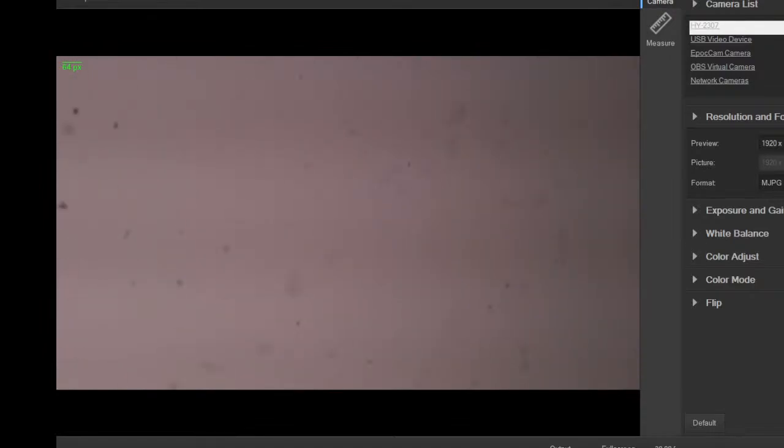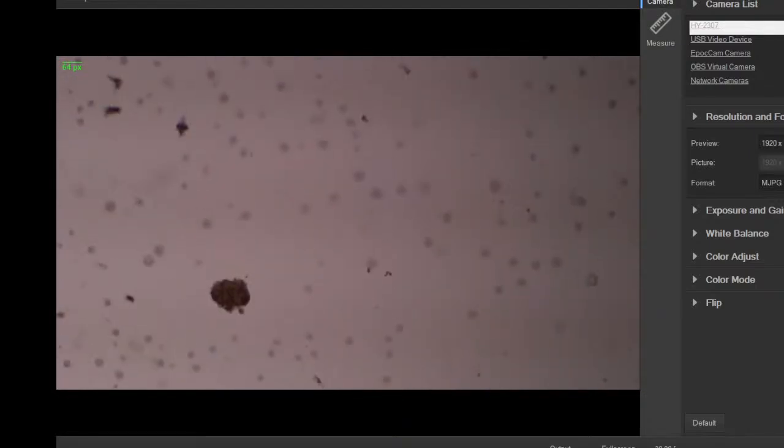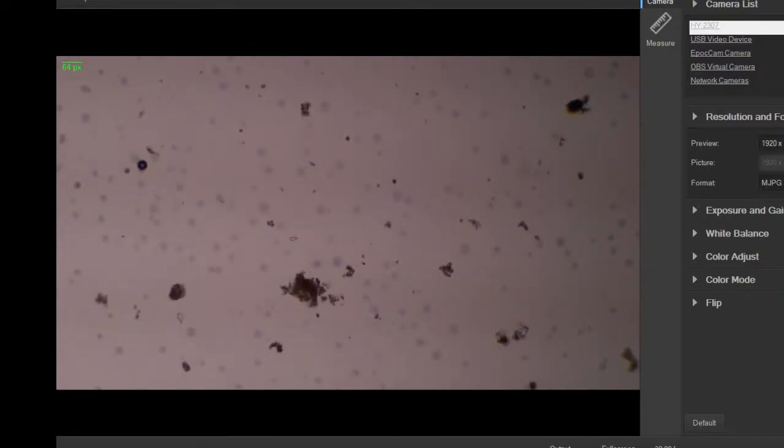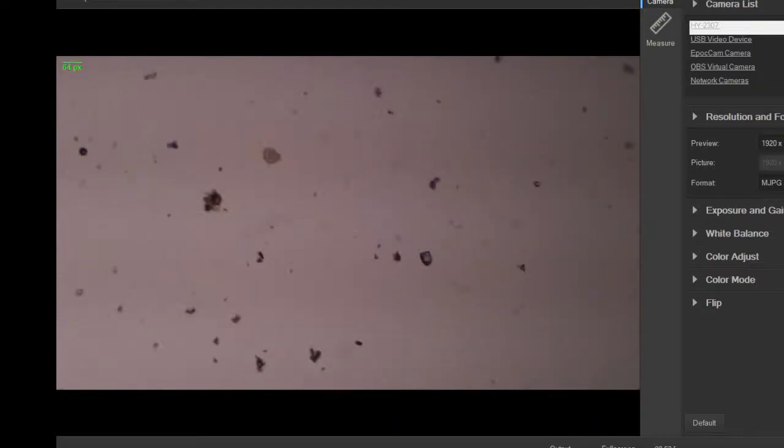Shame I missed that rotifer from earlier. Those are really fun to watch. Got a bunch of them on my other videos. That's dead material.